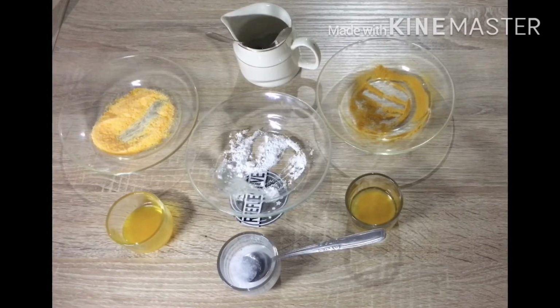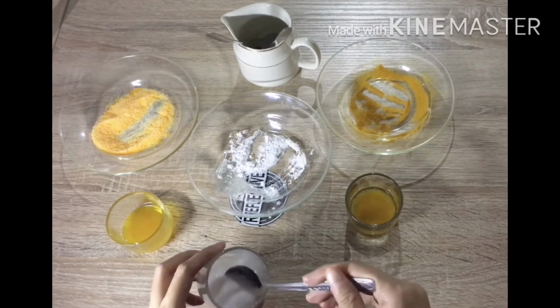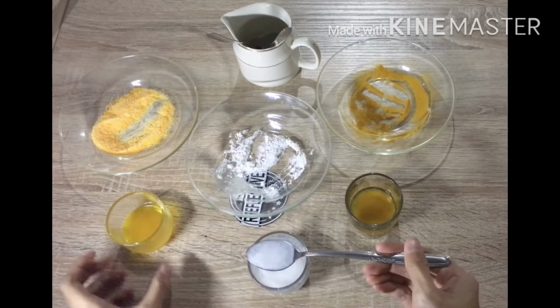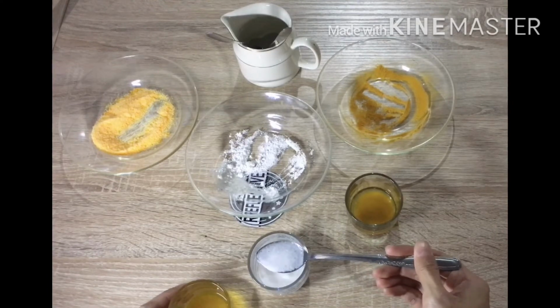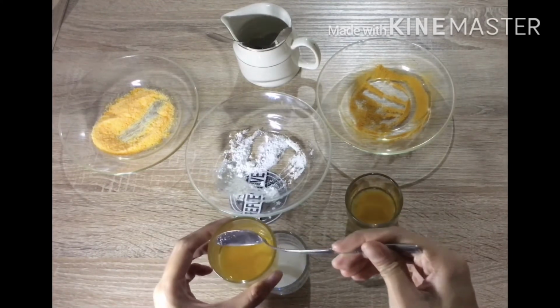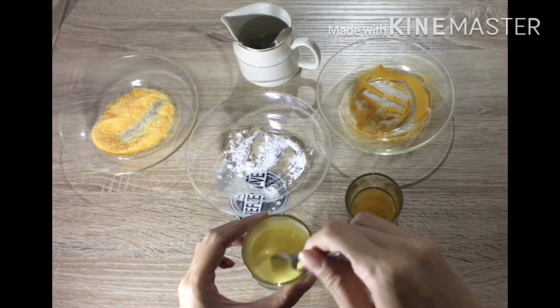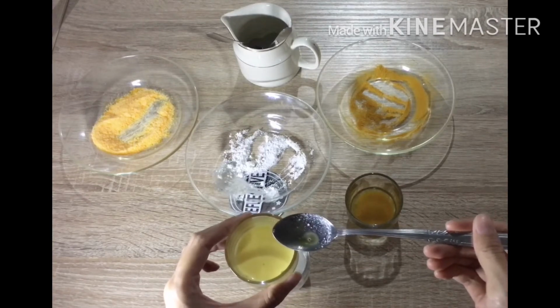Alright, after we make 3 solutions, first I will combine a base solution with orange colored solution. Let's watch to see what happens. The color doesn't change.